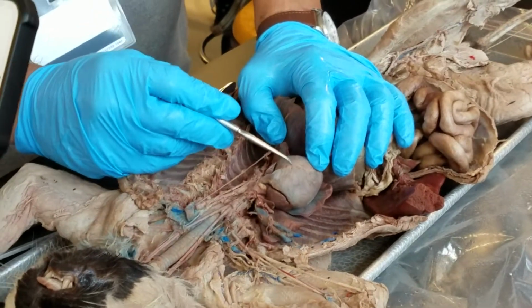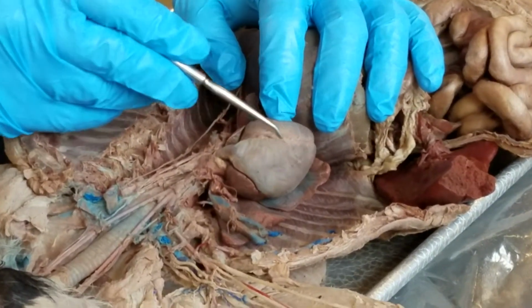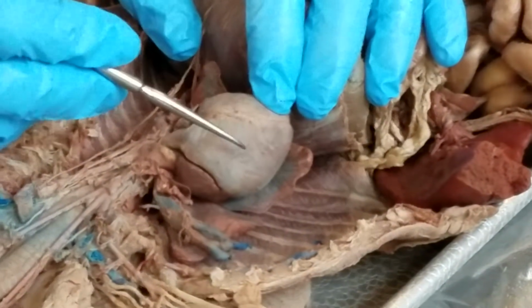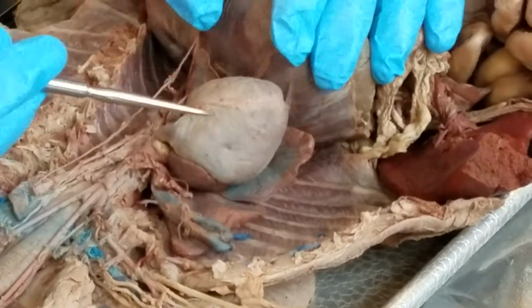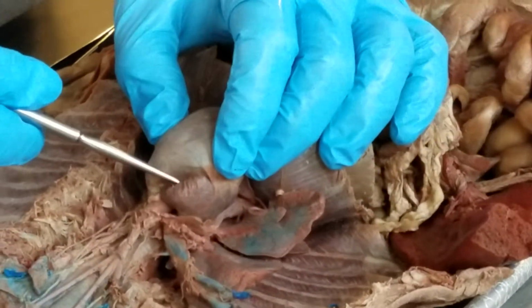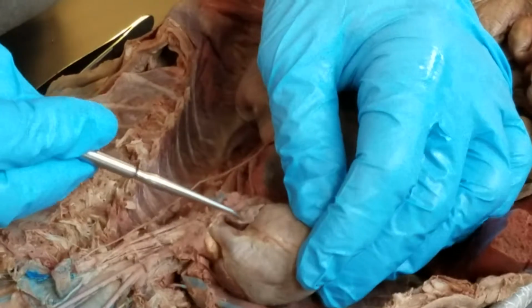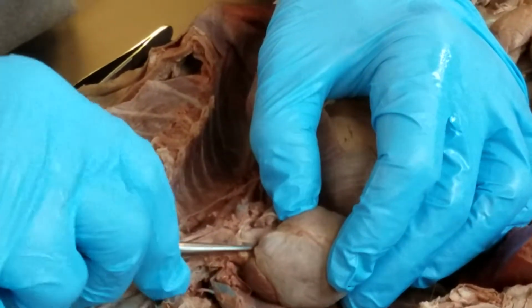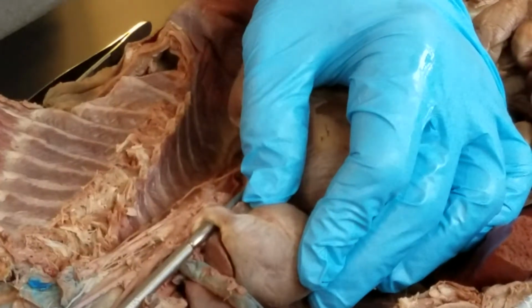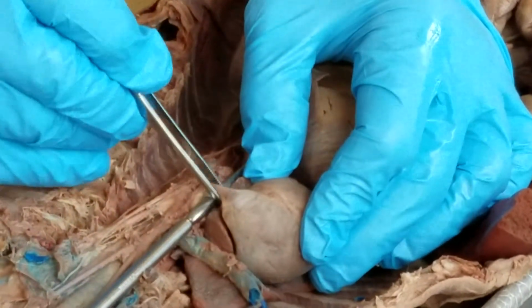Okay, right here you can see the sulcus. So you can actually see the descending artery coming down. So that means this would be your right, and there's your left ventricle, there's the apex. If we roll it up this way, there's your right atria and auricle, there's your left atria and auricle, and right between them is the pulmonary trunk, right here. See it? See how nice it is?